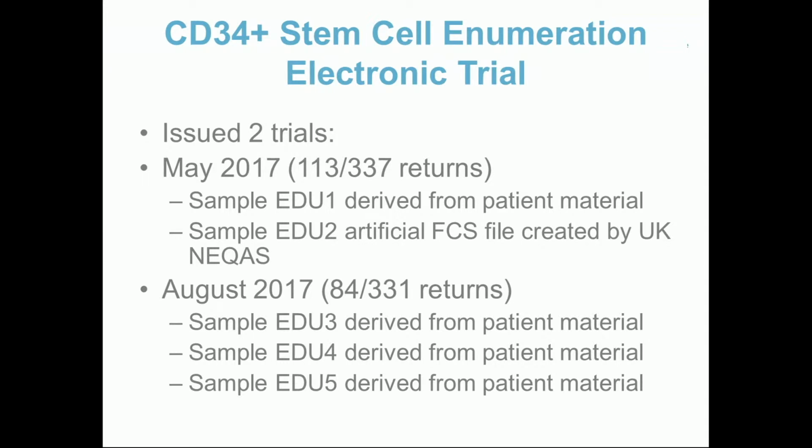If you wanted certain antigens to have weaker expression and stronger expression, we just thought it'd be nice to know if we can do that, and it turns out we can. So that's quite cool.